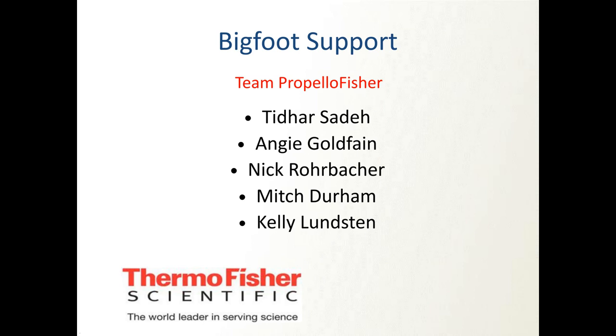As I said before, originally we went big. Our first replicative experiments were 23 and 24 color, and that's a lot. As you start looking at little variances in that, you're not sure: is it panel design issues? Is it one machine or the other? We're trying to unravel this, because we are seeing differences. In some cases, I'm seeing bigger spreading in some channels on the Auroras, and I'm not seeing it as bad on the Bigfoot. In other cases, I'm seeing stuff that's not as bright on the Bigfoot that looks great on the Aurora. So it's come to the conclusion that it's an apples and oranges situation.